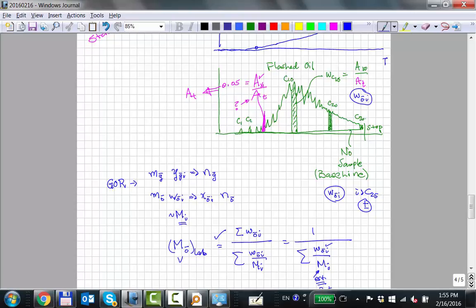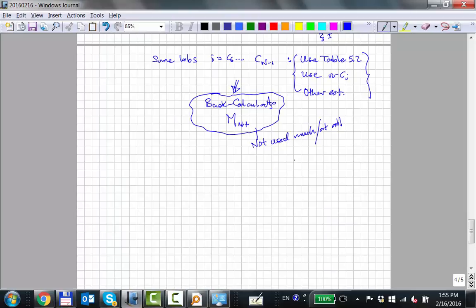So you can start asking the question, why the hell do they make the measurements? It's a very good question. But if you just don't worry about it and don't think about it, you get this detailed analysis with 4 or 5 significant digits, and you feel like you're getting something for the money you paid the laboratory. In reality, you're probably getting so-so data, not trustworthy data. Anyway, at the end of the day, we make this assumption, and then we finally do the recombination, and that's done. I'll show you how that's done.